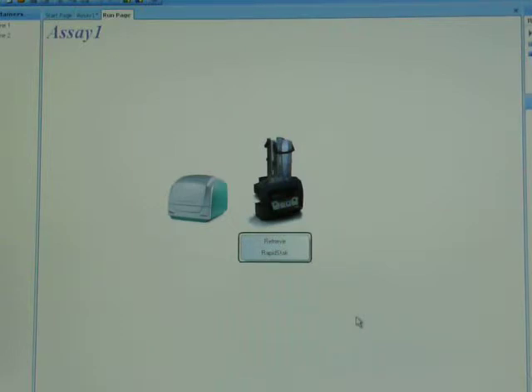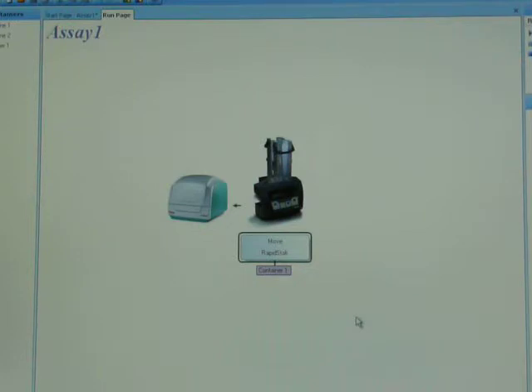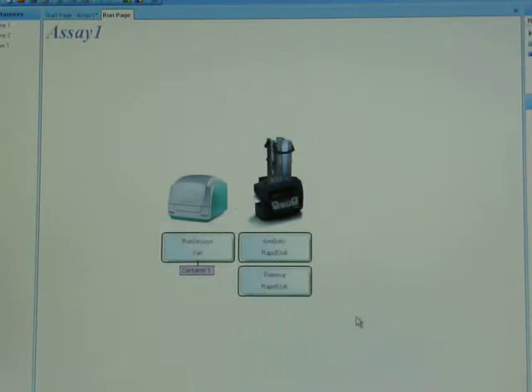Right now you can see that new boxes have popped up on the screen. The RapidStack retrieved a plate and now it's moving the plate over to the VarioScan. You can see a little arrow, and you can see Container 1 session is being run on it.